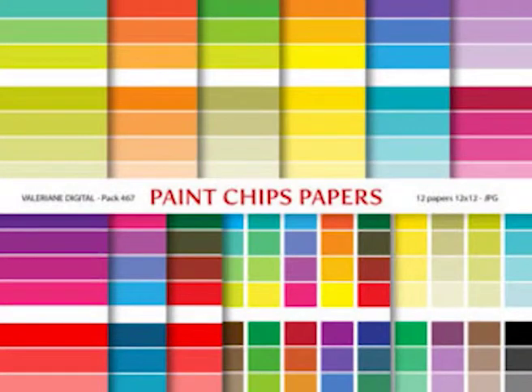Now, coming to infrared spectroscopy. Since the paint fragments are small, a Fourier transform infrared spectrometer is recommended. Out of transmittance or reflectance techniques, it is the transmittance technique which is preferred, as most of the binder pigments have characteristic spectra. In this type of spectroscopy, samples of individual layers are prepared using scalpels, blades, forceps, etc. and placed on a small plate or an appropriate mount, and then analysis is carried out.